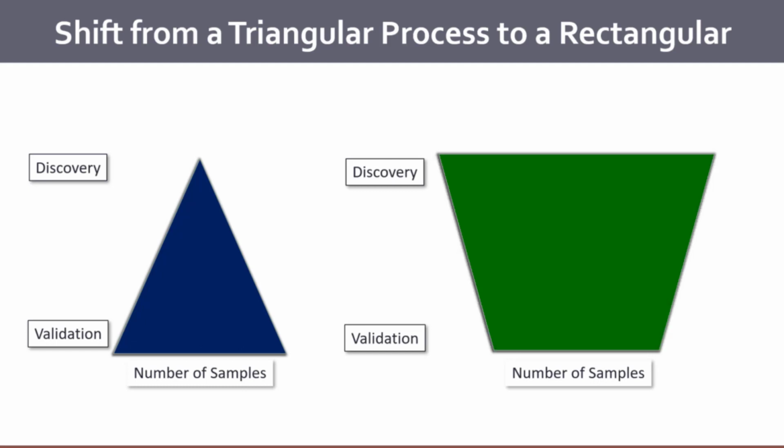So often it may end up being down the road that we actually do experiments that are a little bit more like this. But I do want to make sure that people are aware of this, because it's just a hypothetical experiment. It's often good, before you start doing your experiments, to work with a statistician who might be helping you with these data sets to ensure that your data is correctly powered.